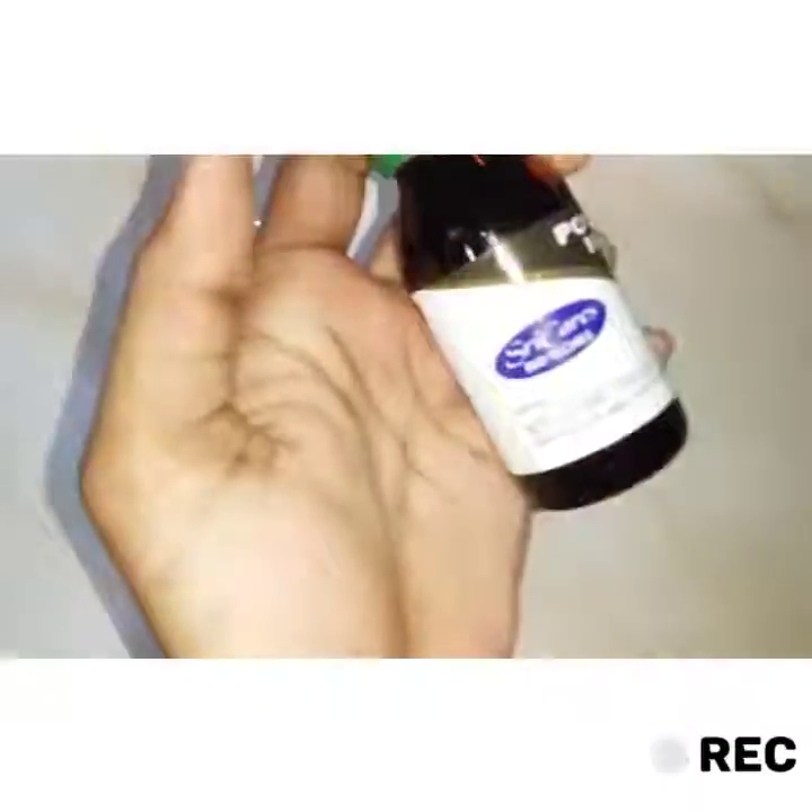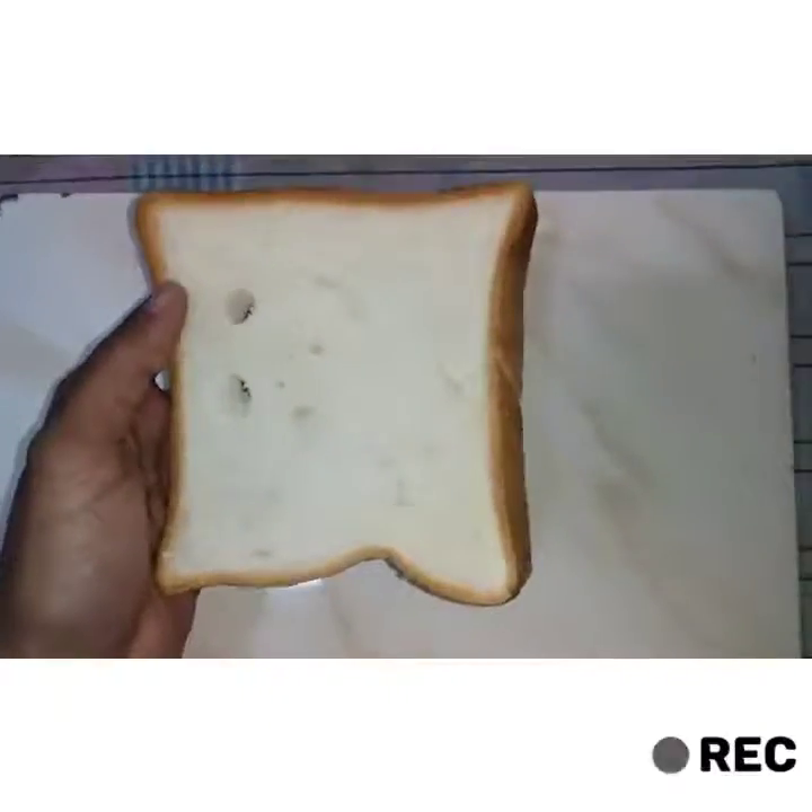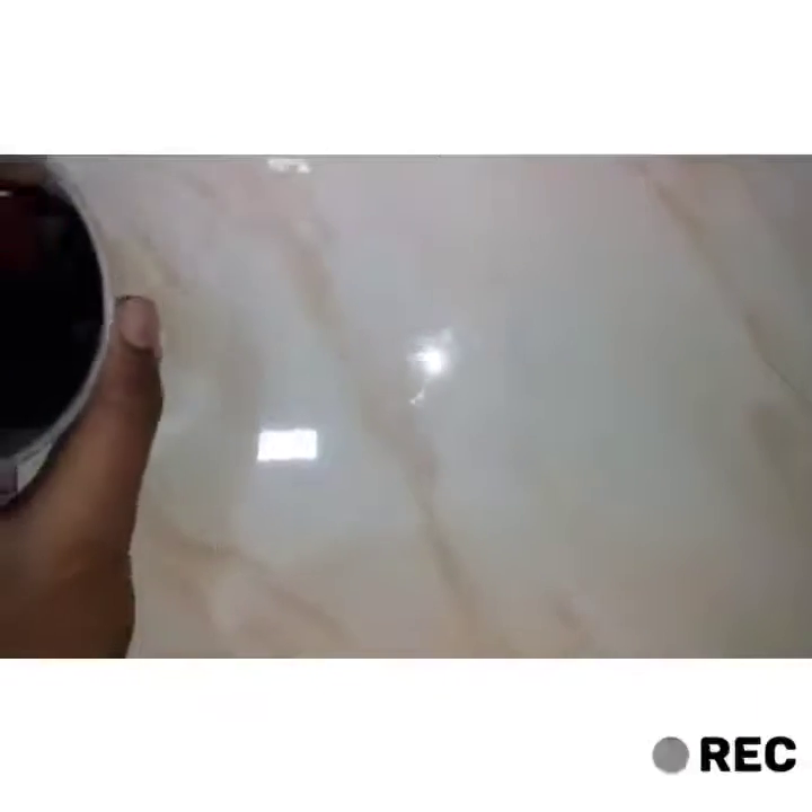Hello friends, in this video we are going to do the starch test. To do the test we need iodine solution, a slice of bread, and a dropper. Let's start the test — we need to get the iodine solution.